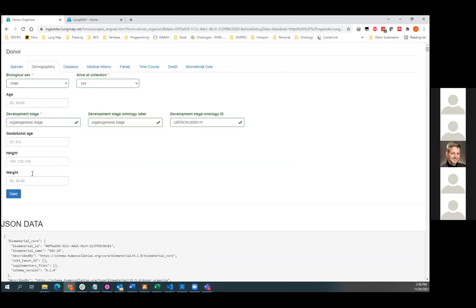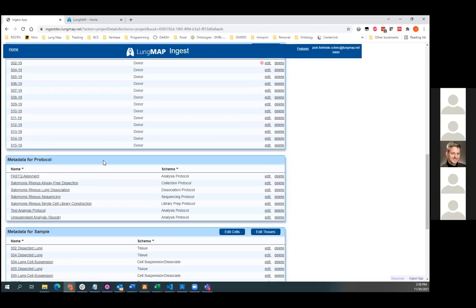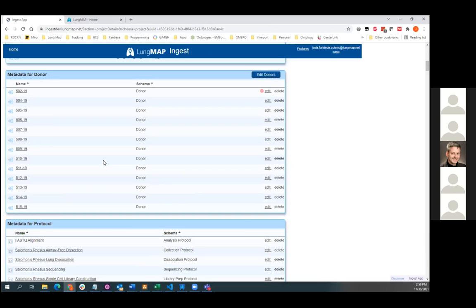And this does have a lot of the same functionality, but here you can only curate one at a time, and it might be a little bit harder, whereas the spreadsheets allow you to enter in a dozen at a time and then easily curate them.